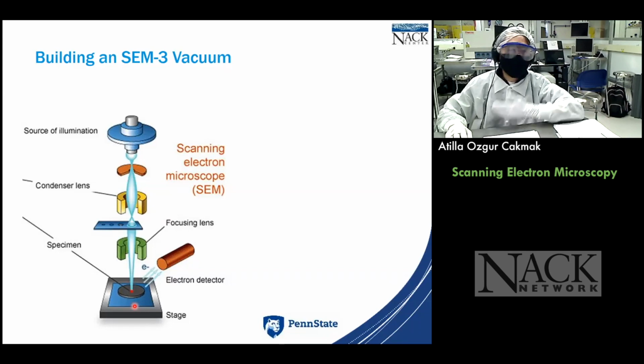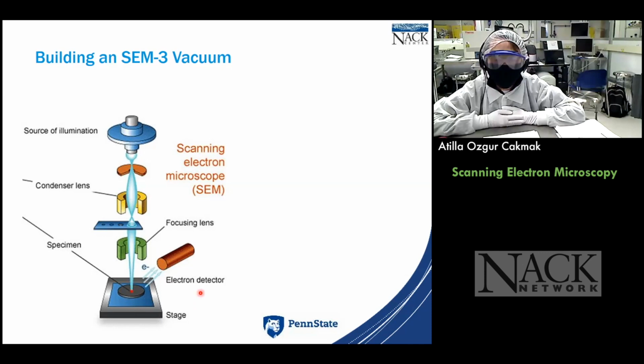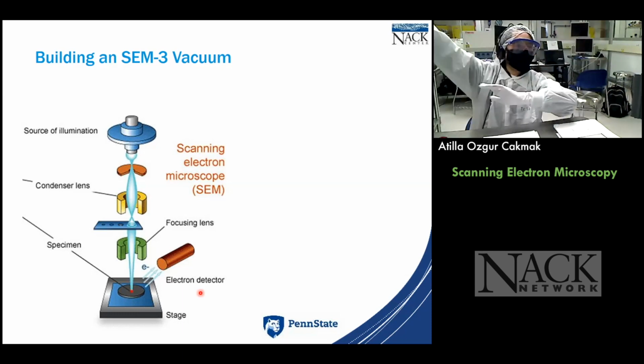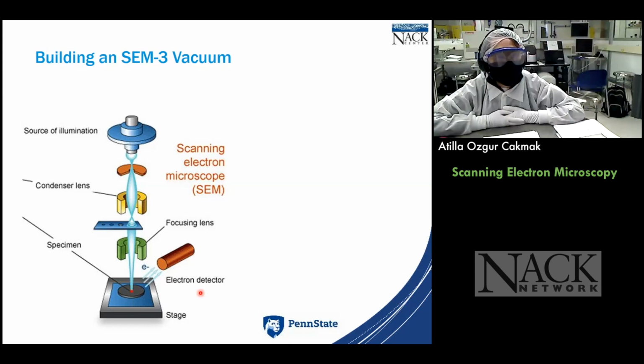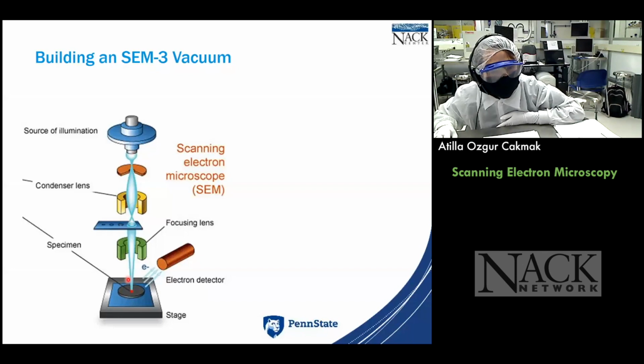like, I don't know if you watch, I'm a Star Trekkie. There was one of the shows where they were sent to the, what was it called, Gamma Quadrant, like billions of kilometers away from the region where the Earth is located. So in electron sense, this sample is billions and billions of kilometers away from this illumination source. So it's impossible, even if we guide it, to expect that the electron will complete its journey.